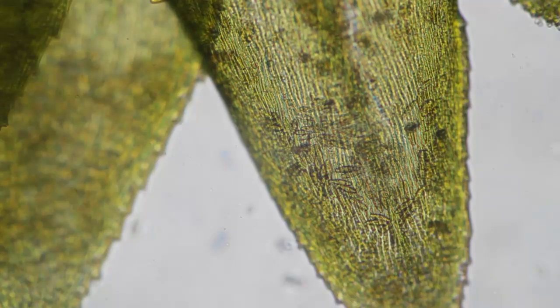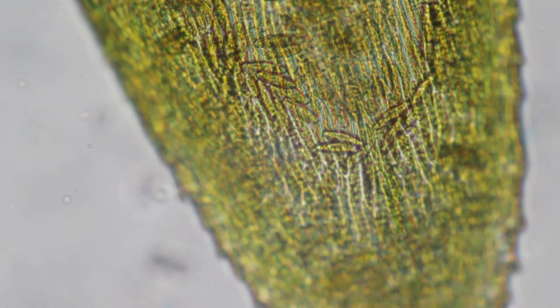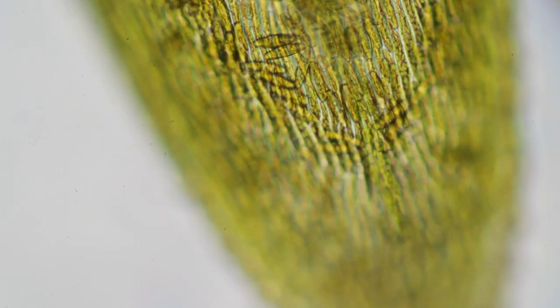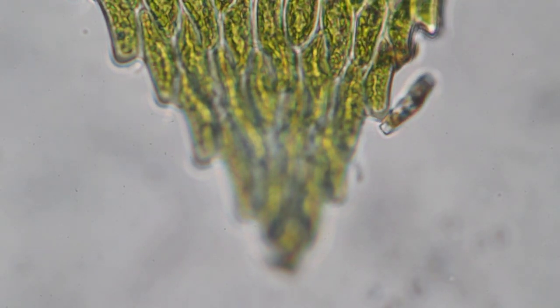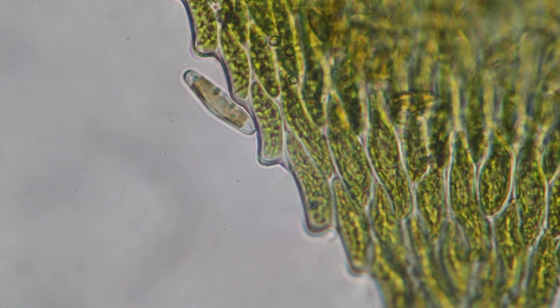Here are some cells and some diatoms. Yes, on the moss there are some diatoms. I'm going to zoom in a little bit — I don't know if you can see them, but that's actually quite nice. Those elongated structures that you see, these are diatoms; they seem to be growing on the moss. You can also start to see the individual cells much better and also the chloroplasts of the cells. So basically there are diatoms growing on the moss — quite a few of them. There seems to be a whole colony on here. Some of the diatoms are moving around, they're gliding, and this one in particular is quite large and quite well visible as it moves along the surface of the moss.